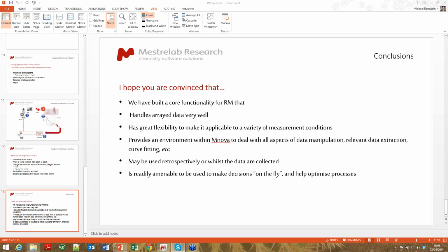Okay, I think I know what you're saying. And in some of those spectra, some of those plots, you could see that the concentration looks as if it was negative. Yes, you can do that. Paul, let's speak, and I'll show you how to do that.